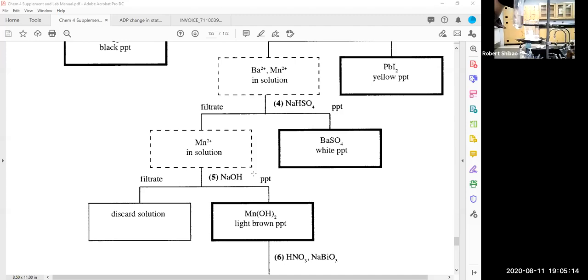So what I did was I redissolved it. There's no more precipitate in there. I just redissolved it using hot heat, and then I'll just add some KI to this, and as expected, we get a nice yellow precipitate. Now I got to make sure I get all that precipitate, I mean all the lead out of there, because I don't want lead to interfere with the subsequent analysis.